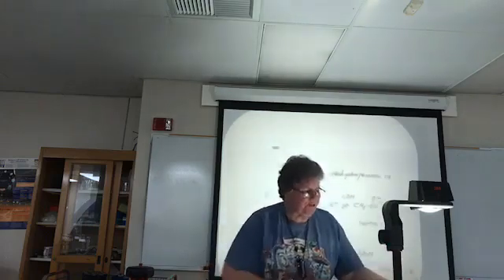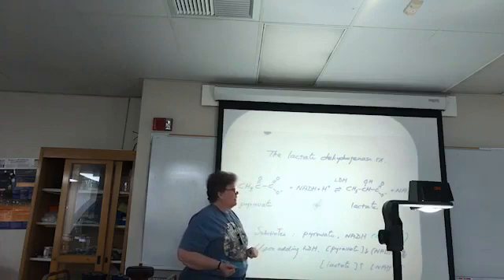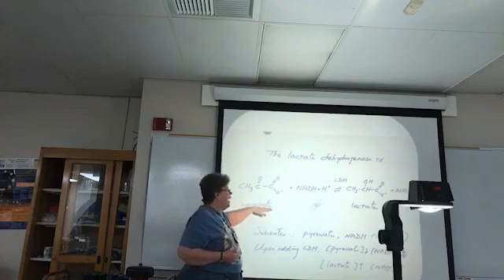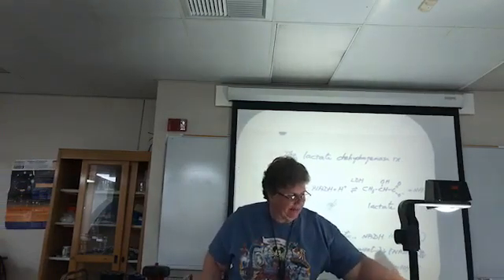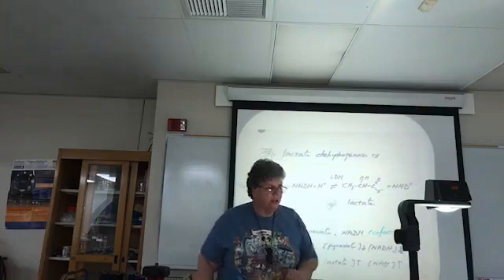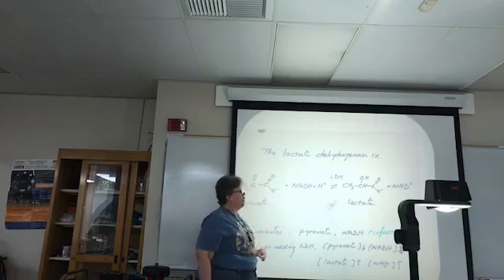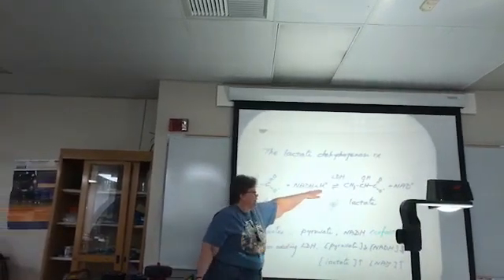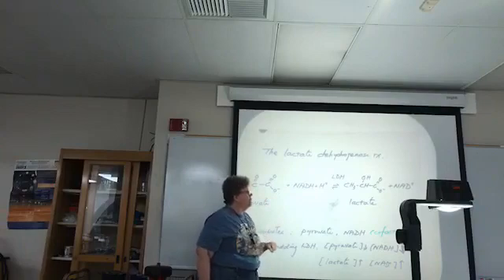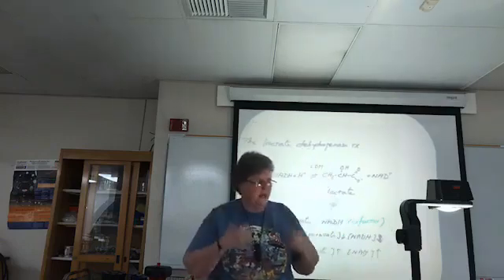The specific reaction that we are talking about in this upcoming experiment is the lactate dehydrogenase reaction. The lactate dehydrogenase reaction takes pyruvate and reacts it with NADH in the presence of an extra hydrogen. Lactate dehydrogenase turns the pyruvate and the NADH into lactate. Basically, across the carbonyl carbon right here, it adds 2 hydrogens: 1 hydrogen from the solution and 1 hydrogen from NADH, turning it into lactate plus NAD. That's the entire reaction.